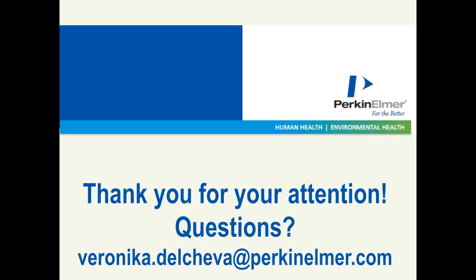That's clear. And so Julius, if you can just clarify that last point. What have you noticed in terms of costs when you move to the LabChip approach compared to the disposal costs on gel? I think I completely agree here with Veronika. The more you run it, the cheaper it is. That's why it's good to run several samples at once and to run more, because then the prices go down. We did some research at the beginning, trying to compare it, and it was, I think, almost the same at the beginning for well-priced precast gels and just running the sample on the LabChip.